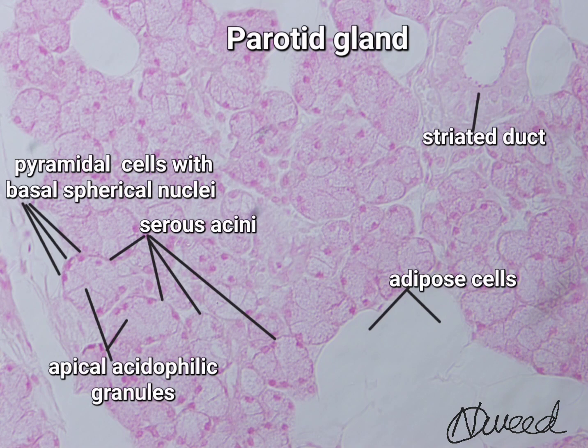The main duct is lined by stratified cuboidal epithelium that changes to stratified squamous non-keratinized near its opening. Adipose cells are abundant in the connective tissue of the parotid gland.